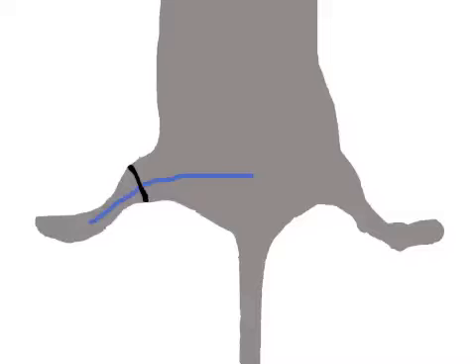The sensing electrode, indicated in black, is installed at a position where the gastrocnemius muscle has its maximum diameter.